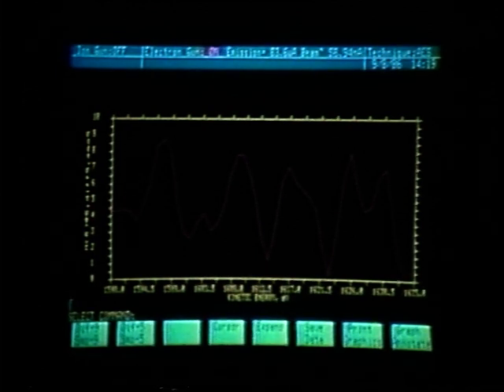What that will do is, if we allow that to be calculated in the atomic concentration profile, it will tell us that we have silicon that is not really there. So we want to keep that in mind when we calculate the atomic concentration.